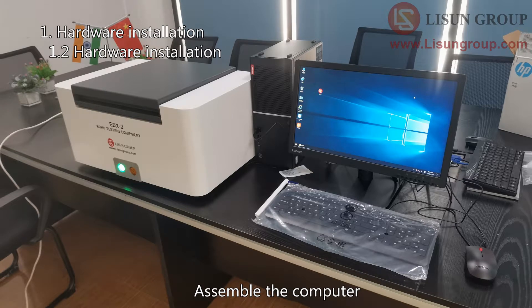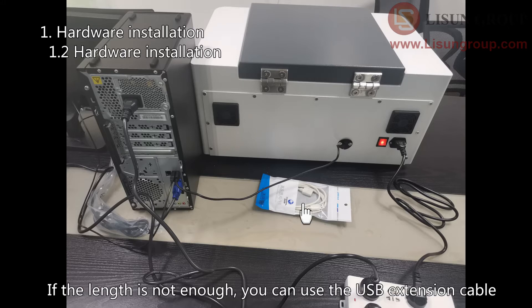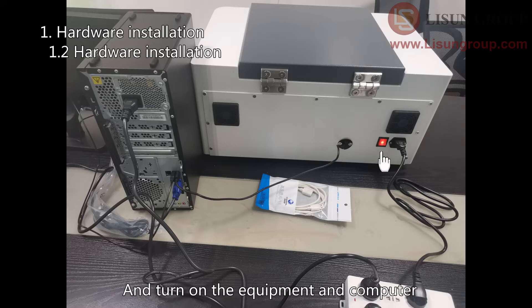Assemble the computer. Connect the USB cable on the back of the equipment to the computer. If the length is not enough, you can use the USB extension cable. Connect the power cords to the 220V 50Hz power supply, and turn on the equipment and computer.